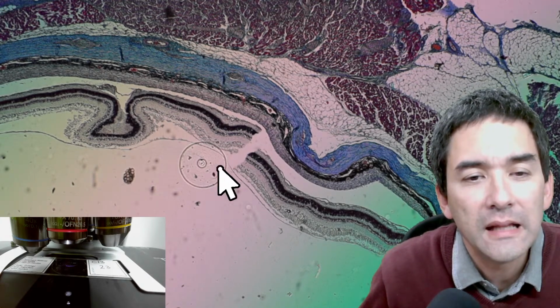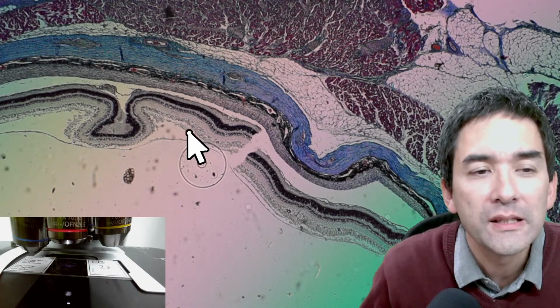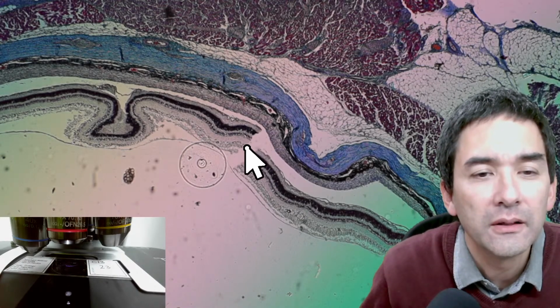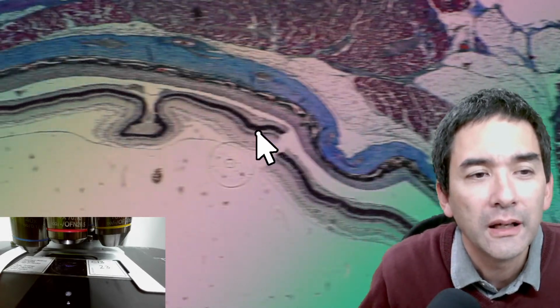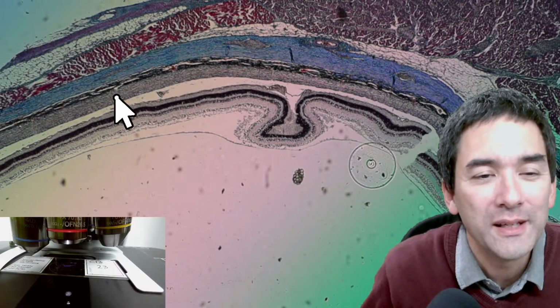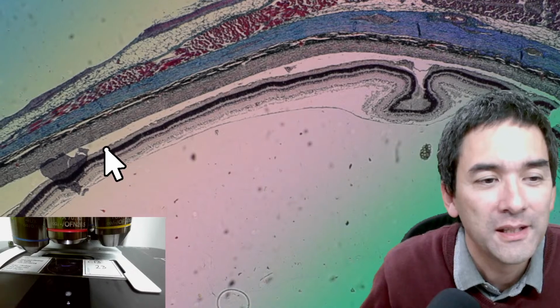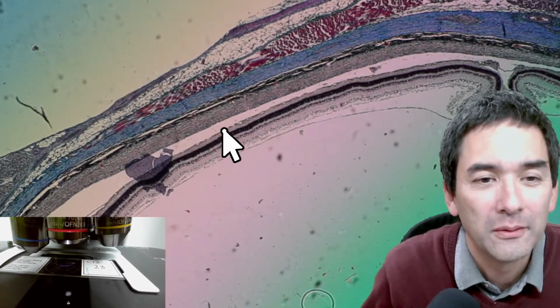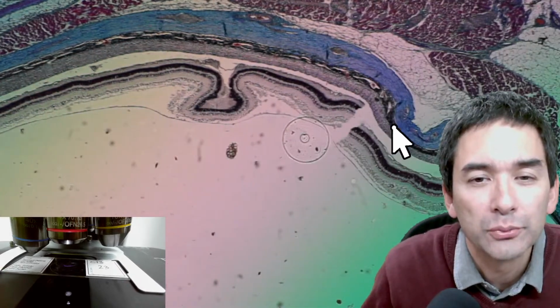This is the inside layer of the eye, which is light sensitive. And look, it's ripped here because this happened during the preparation. The retina also seems to have separated from the rest. Retinal separation is, as a matter of fact, a disease, a problem, but here I think it might have separated because of the preparation.